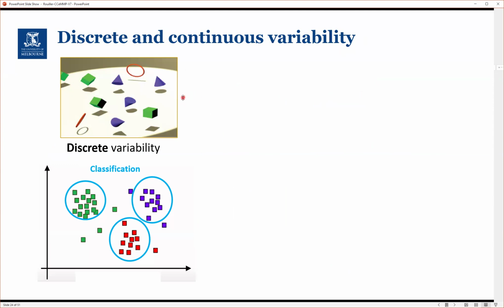As mentioned, in cryo-EM, on your EM grid, one is expected to have all the possible conformations of a protein. If the different conformations are discrete, where we have a defined set of conformations, then you can use discrete classification, where you split the data into a set number of groups, in this case 3, but it could be whatever. You typically try different values and see what works. Then you can get fairly decent reconstructions.